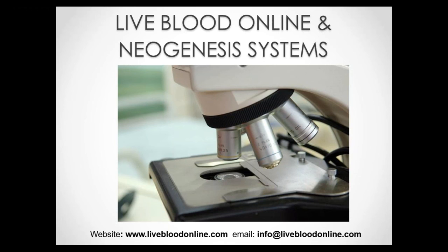So I think the first point really is just that live blood analysis enables you to detect underlying imbalances at the cellular level. Now, these are the same imbalances that complementary and integrative practitioners need to work with to allow the body's own mechanisms to facilitate healing. These underlying imbalances are also instrumental in the development of disease and therefore usually precede disease. This means that as practitioners, we have a technique here that is truly valuable in preventative medicine because we're able to identify imbalances at a very early stage before the onset of pathology. And we can then take the necessary steps to reverse the process.